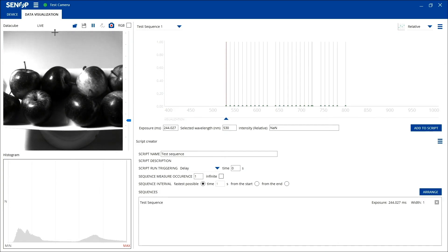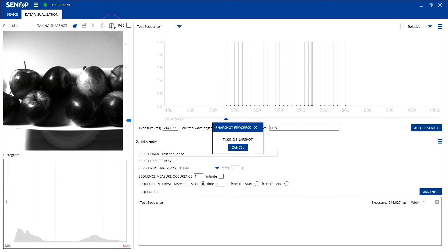To take a snapshot with a defined sequence, click the Record button. The camera will now take the desired frames as defined in your sequence. A status window shows when the measurement is done.